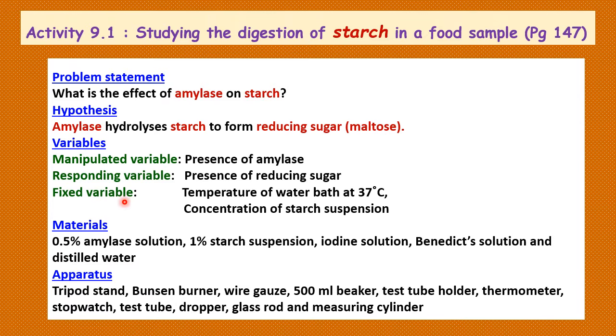Then the fixed variable, temperature of water bath, is at 37 degrees Celsius, which is the optimum temperature for enzyme reaction to occur more quickly. Concentration of starch suspension is also a fixed variable. So we use 1% starch suspension.